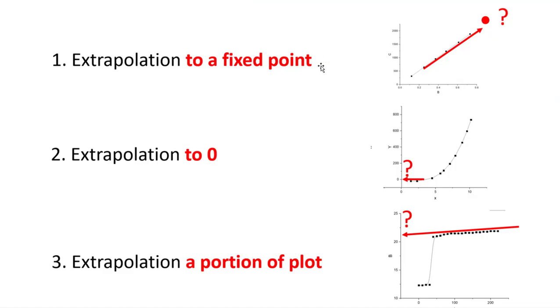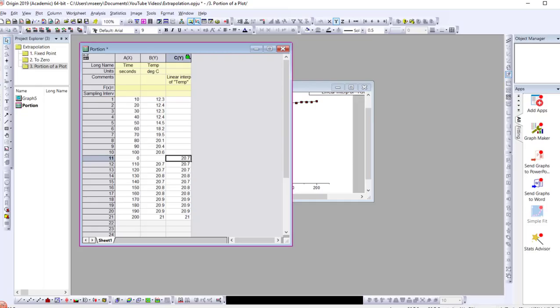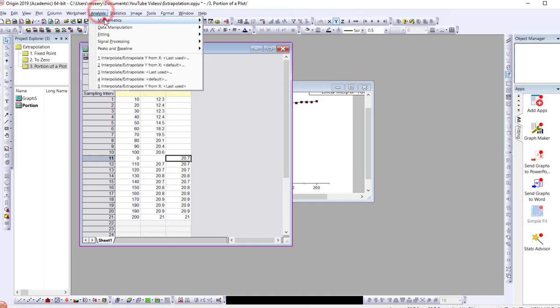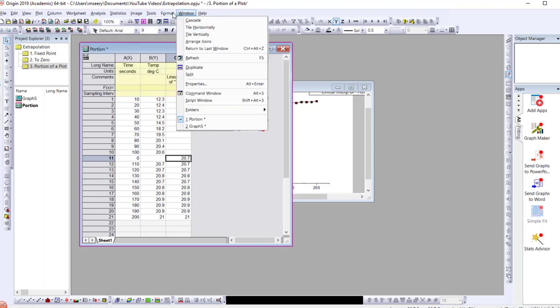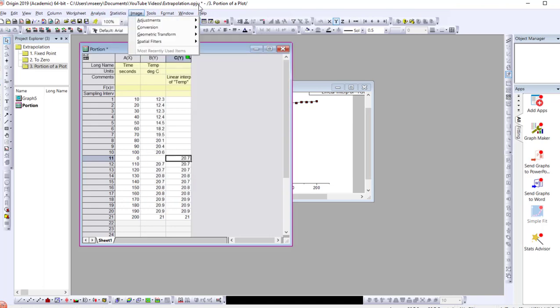That summarizes the three general ways of extrapolating in Origin: extrapolating to a fixed point, extrapolating back to zero, and extrapolating a portion of a plot. This is all based on the Interpolate Y from X approach, and there are other approaches as well, but this is certainly a good start.